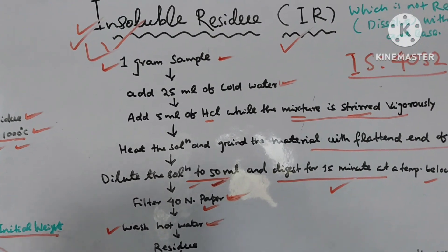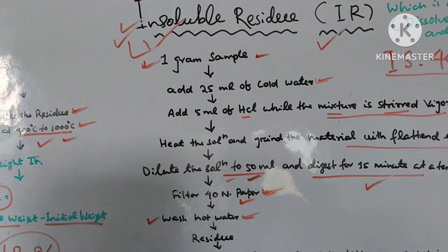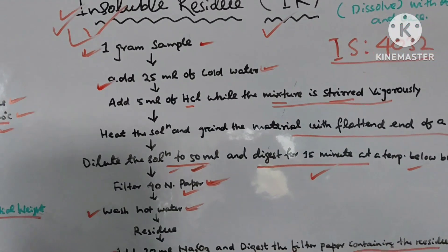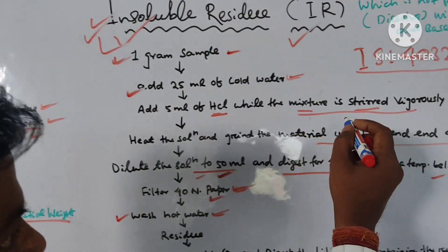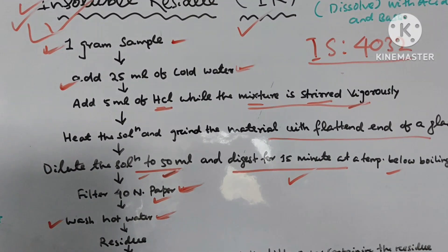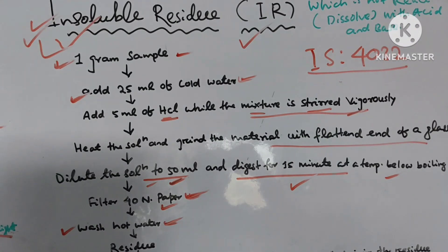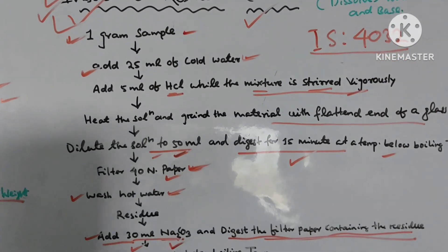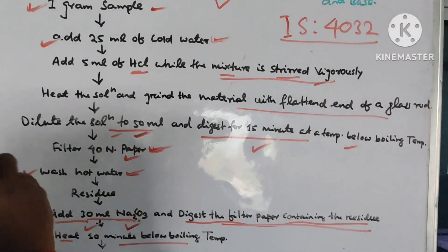Suppose we are going to test IR. We take a simple 1 gram sample. So 1 gram sample of cement. Add 20 ml of cold distilled water, then add 5 ml of hydrochloric acid (HCl) while the mixture is stirred. When you add HCl, it should be mixed properly - stir vigorously for homogeneous mixing, and automatically your result will be perfect.